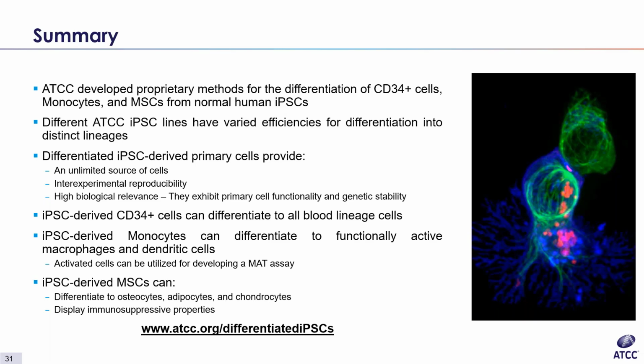You could also look at cytokine responses, chemotaxis, or invasion capability as well. There are a lot of commercially available kits that you can use to look at any of those things.